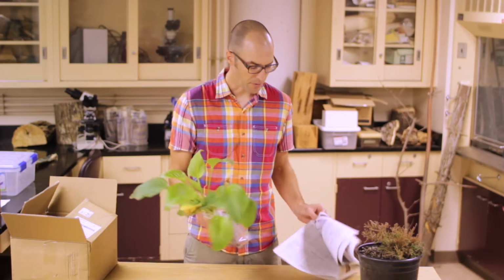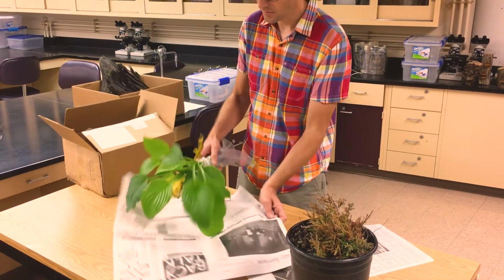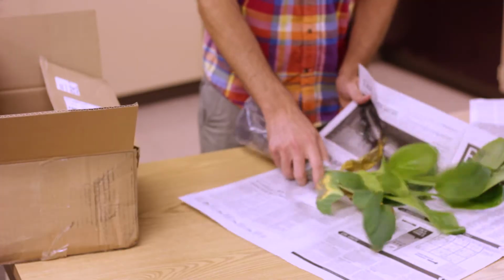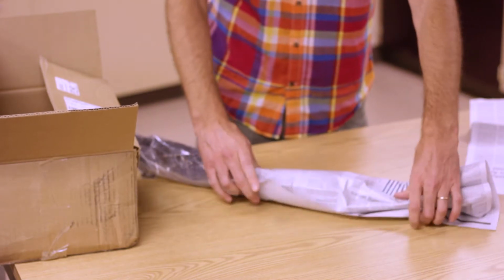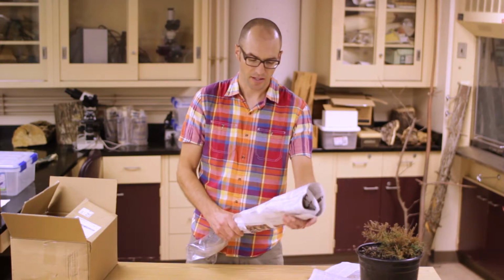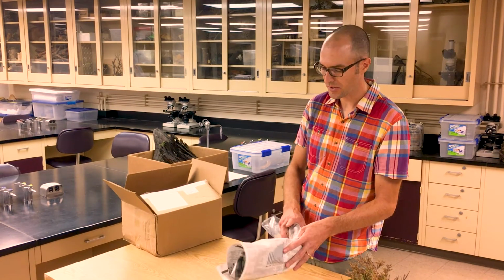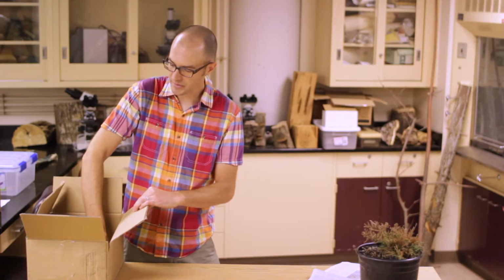And so for the above ground part of the plant, what we can do is just simply take some newspaper and wrap some of those leaves up. And you want to make sure it's dry newspaper. If it's wet newspaper, that's just going to contribute to the sample degrading too much during shipping. And so then we're going to carefully put it in a box, and the newspaper really is just there to prevent the sample from moving around too much.